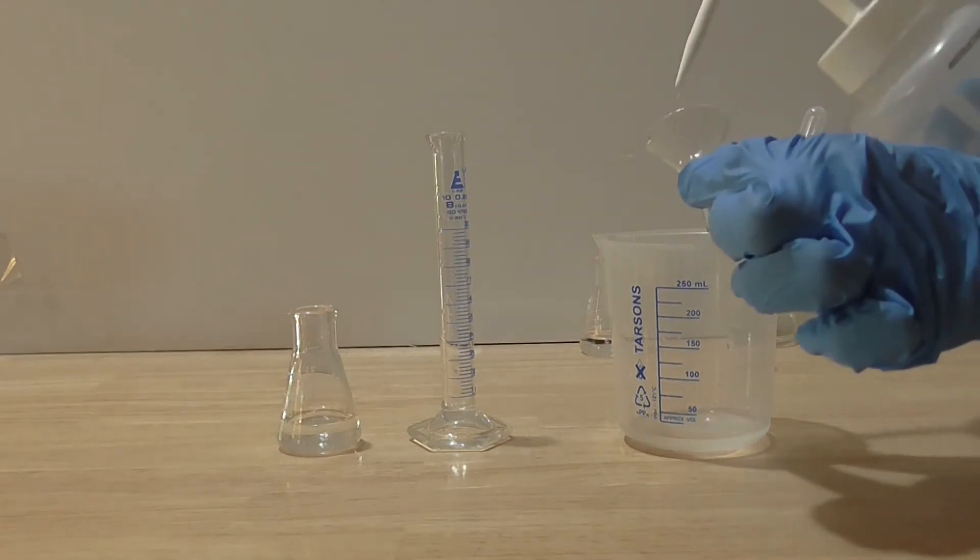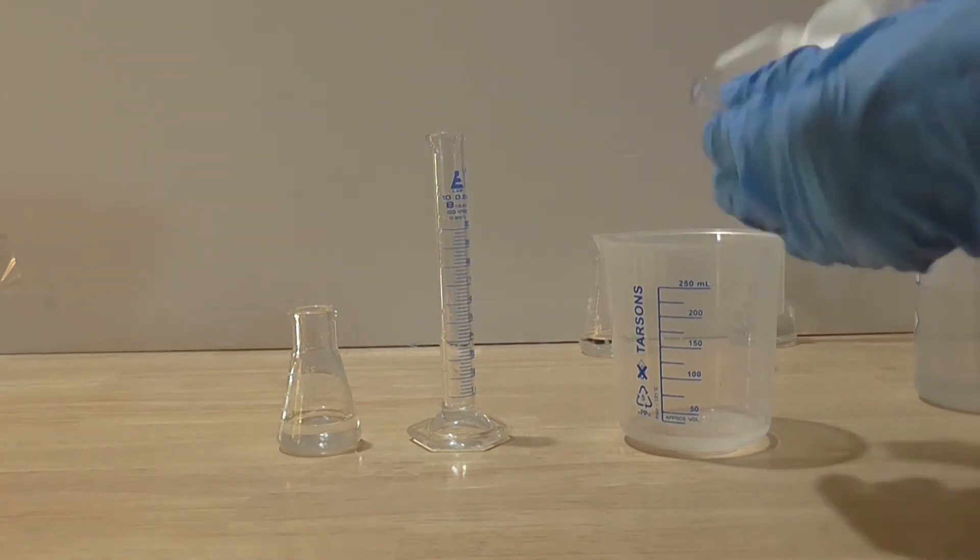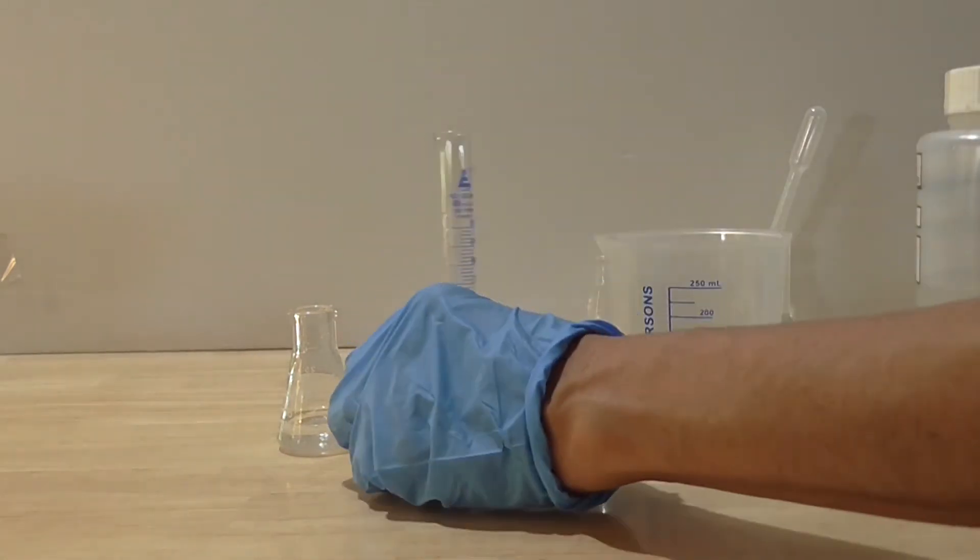Once again, wash and dry the cylinder and glass funnel. Ensure you have a clean, dry glass flask as well.